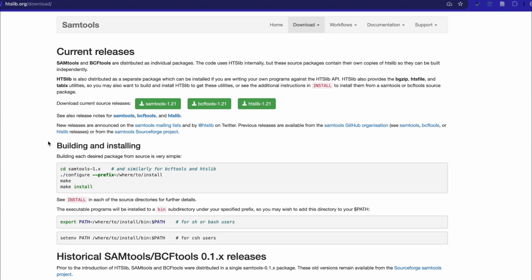Sometimes it works on Mac as well, because both Linux and macOS are made out of Unix from long ago and then diverged, but still have something in common. In Windows, you'd better install Ubuntu for Windows and do all this stuff in Ubuntu. But for Mac computers, there are better options.